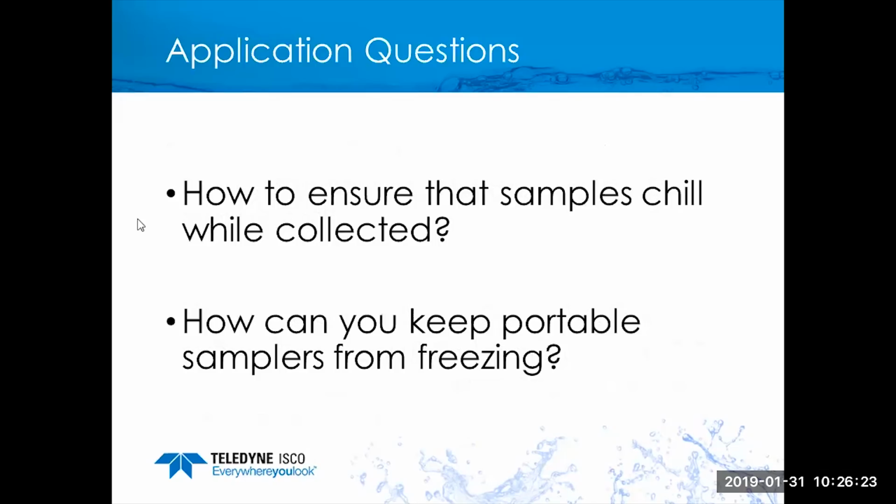Kind of a related question, how to ensure that samples chill while collected? Well, outside of any passive cooling method like ice or gel packs, of course, and keeping the sample outside of any source of heat or direct sunlight, that's the approach in the absence of an active refrigeration system.